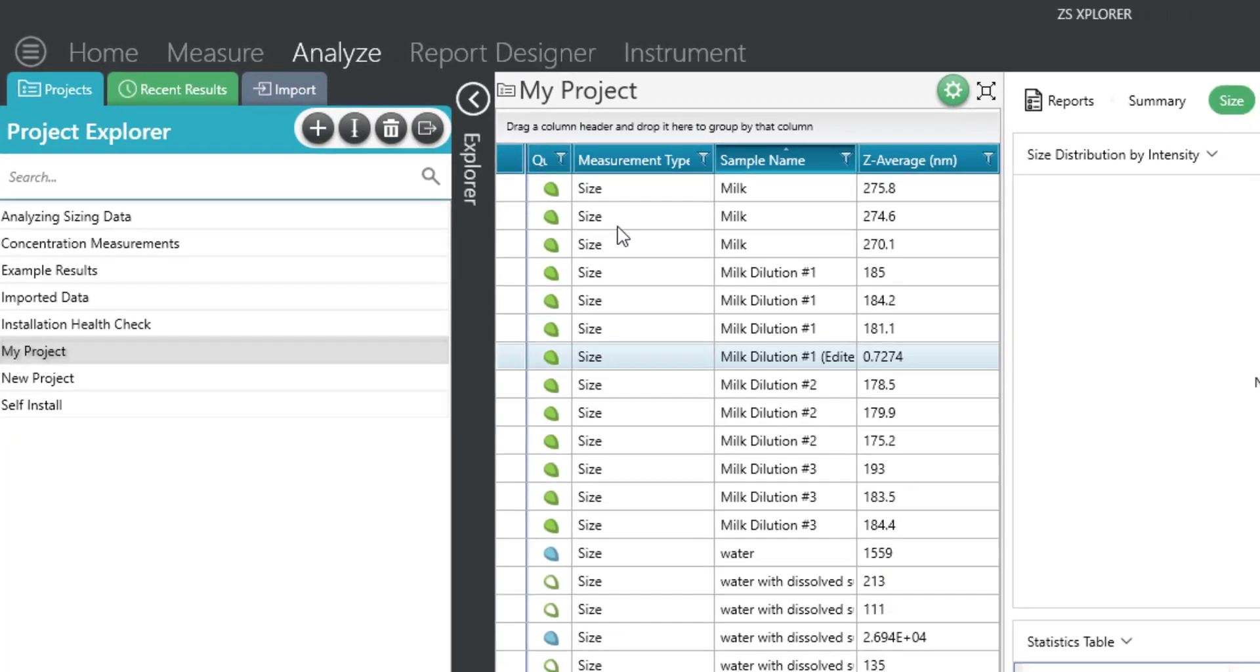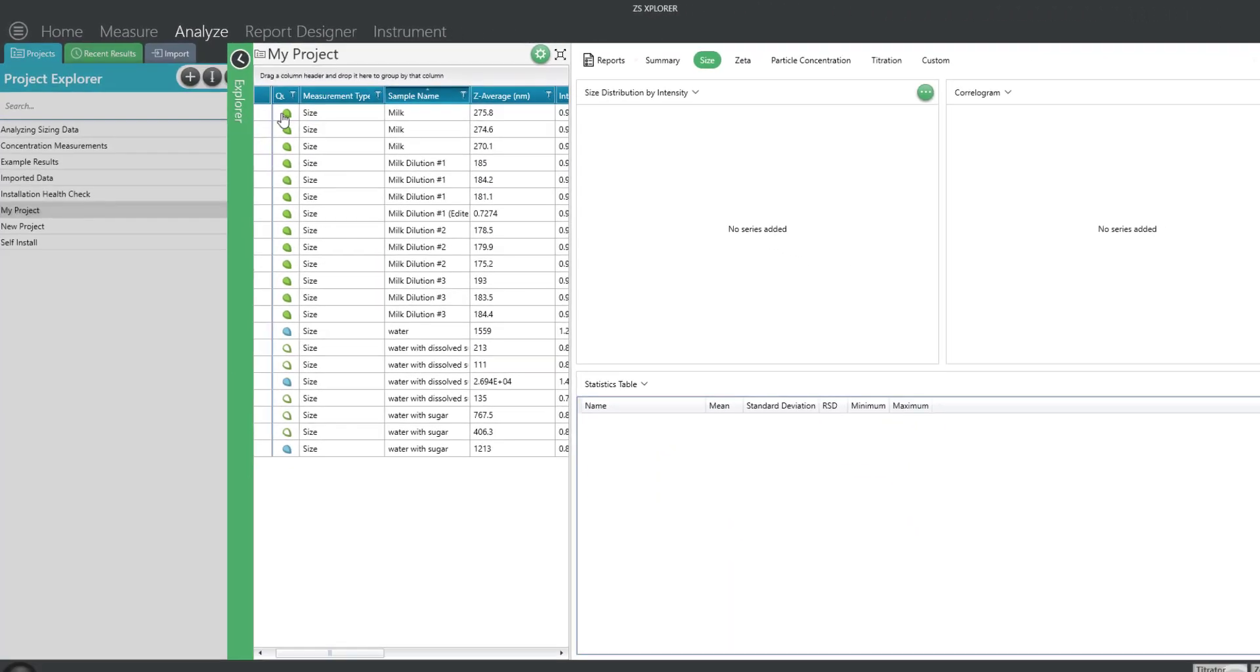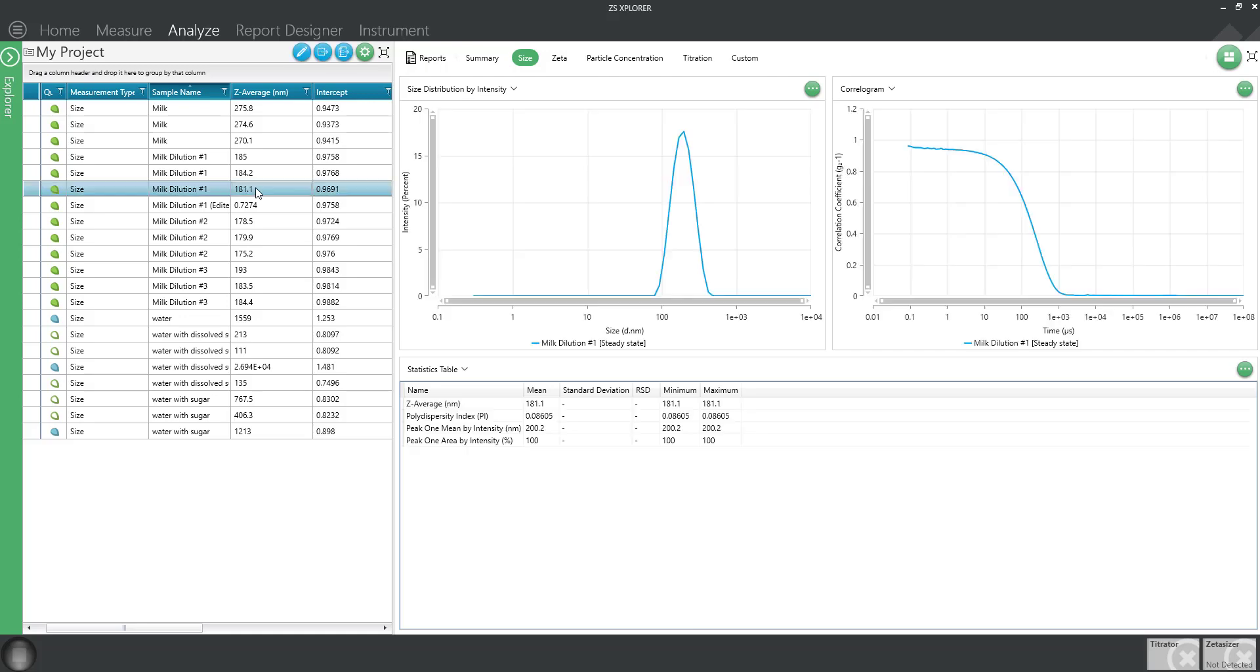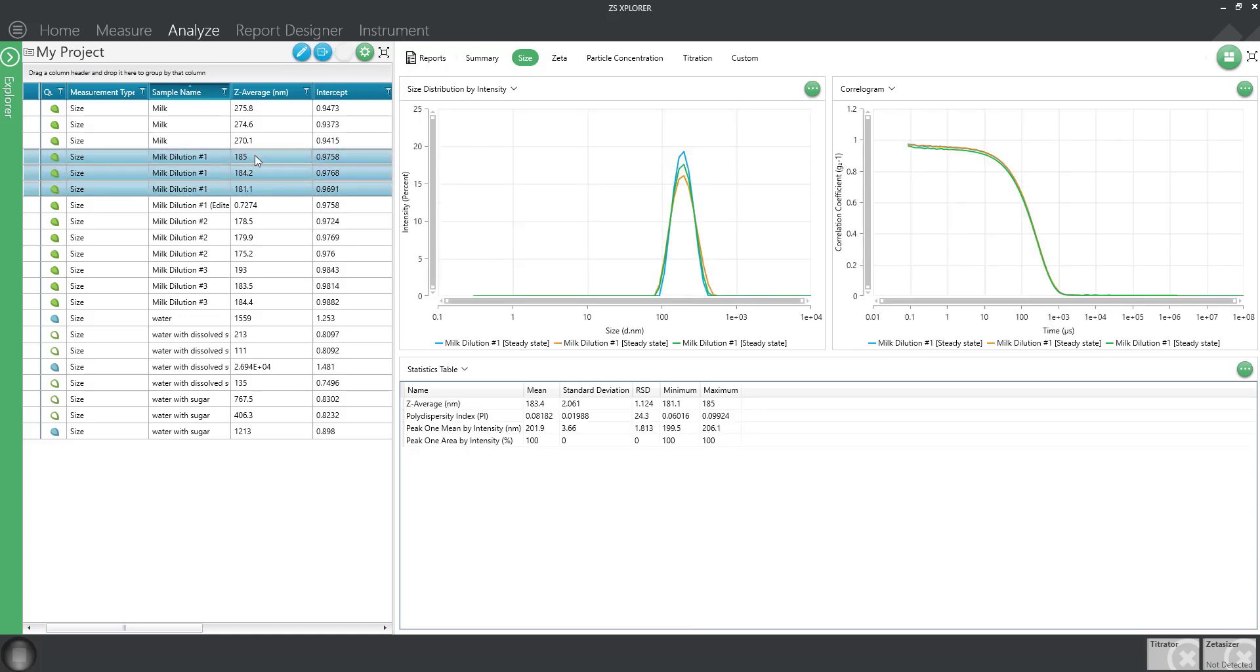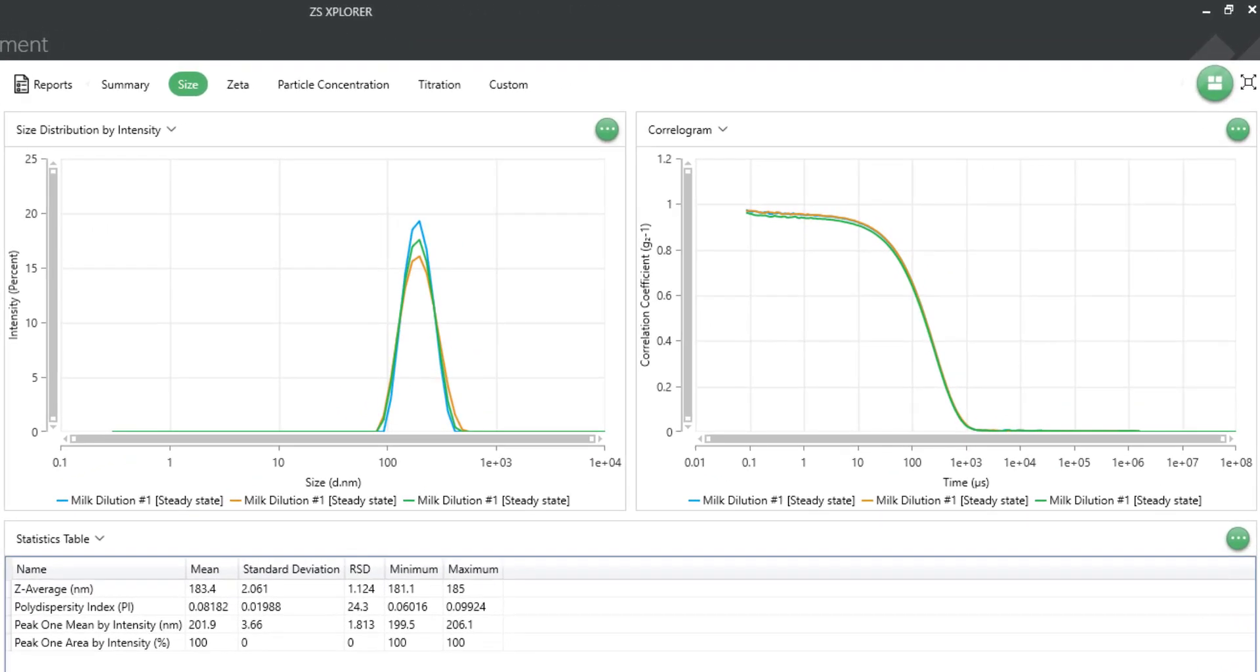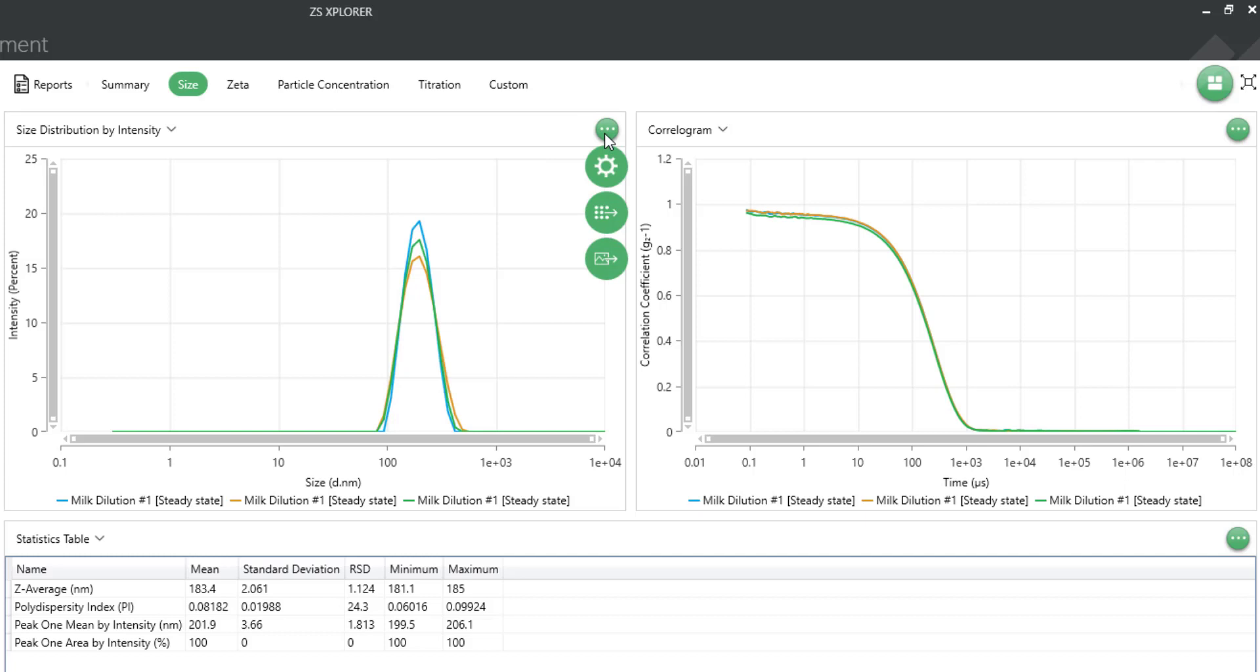Now that we've covered importing and exporting data files, let's discuss ways to quickly transfer a graph or image to a presentation. Highlight the records you want to display and you will notice in the analysis workspace each window has a green button with three dots. This button has a drop-down to copy image or copy data.